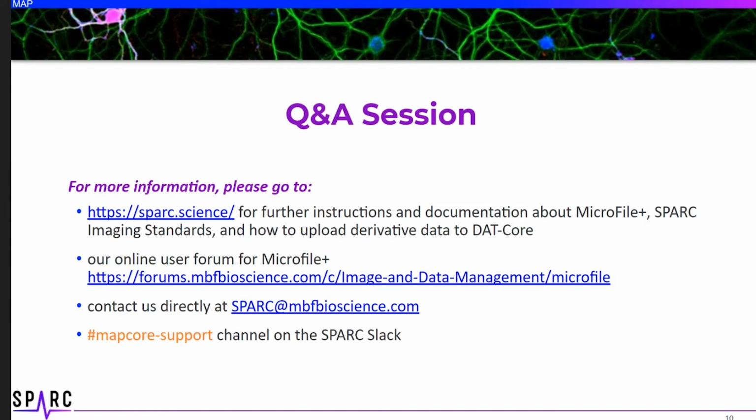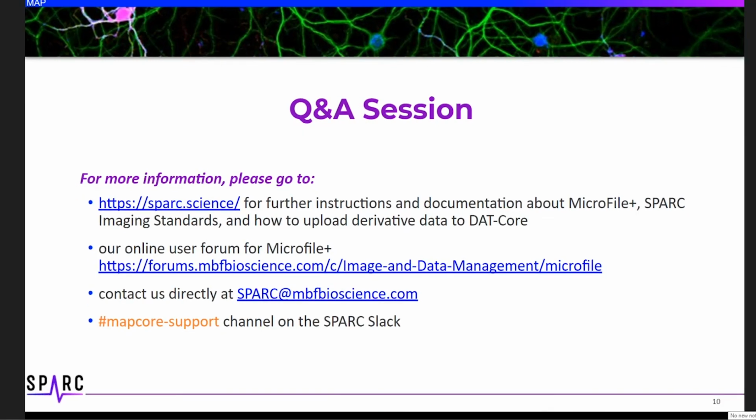In addition to that, it offers some of the same tools that Fiji and ImageJ have for combining single channel images into a multi-channel image or 3D stack. And with that, like Sue said, that metadata is retained where maybe it's not, and it's editable in MicroFile Plus.